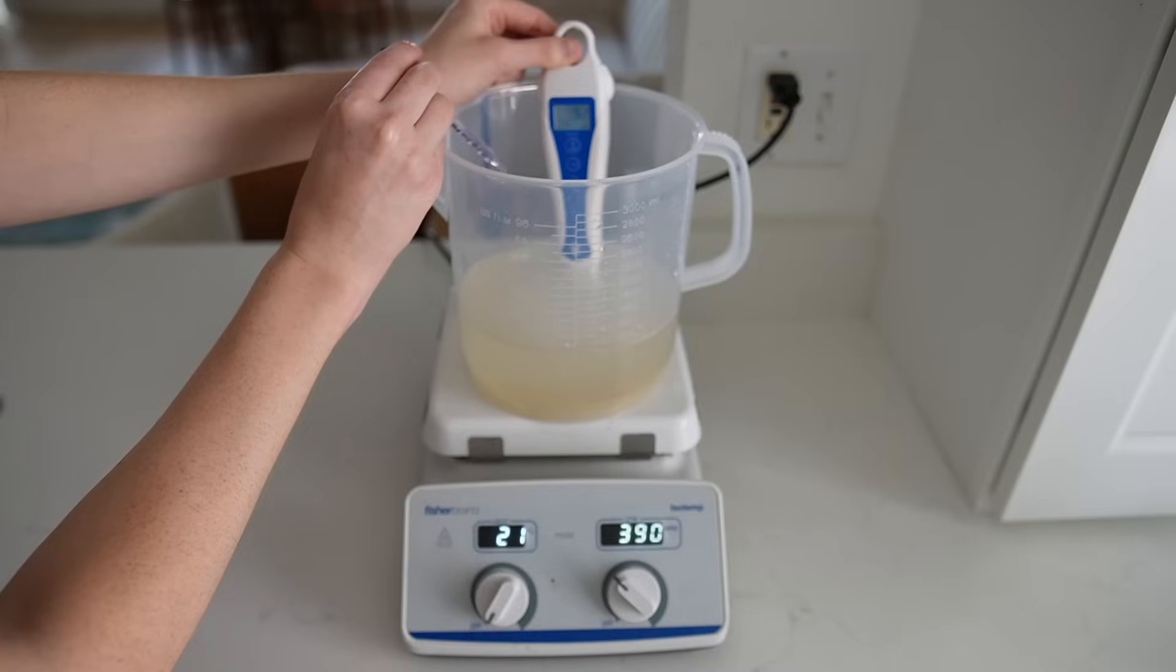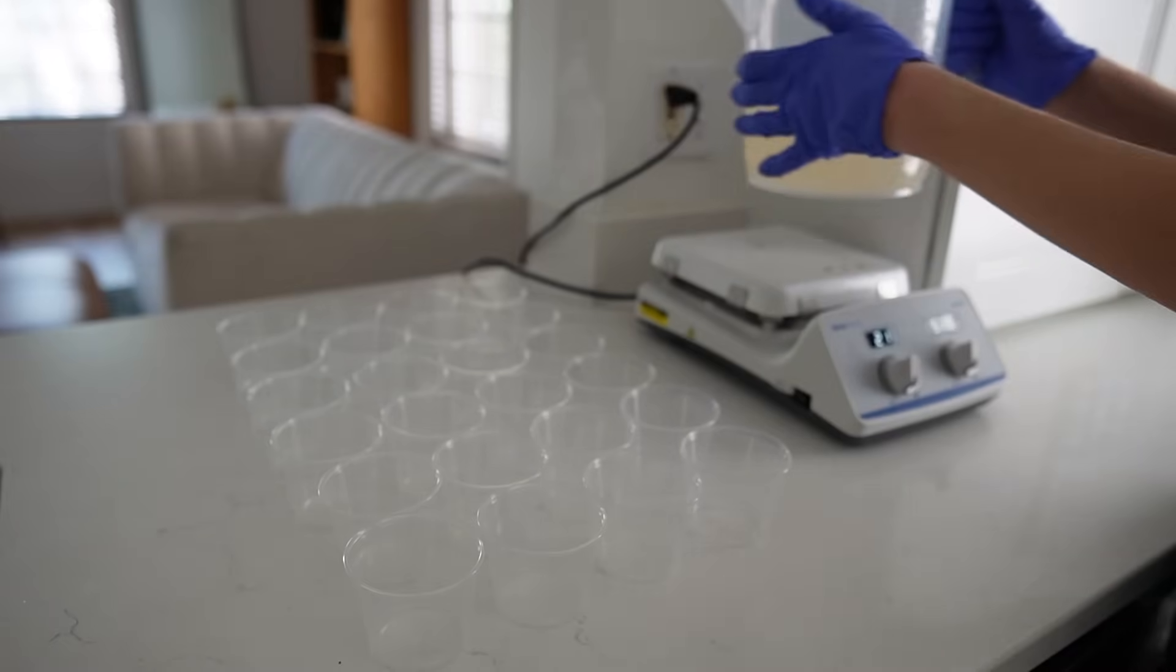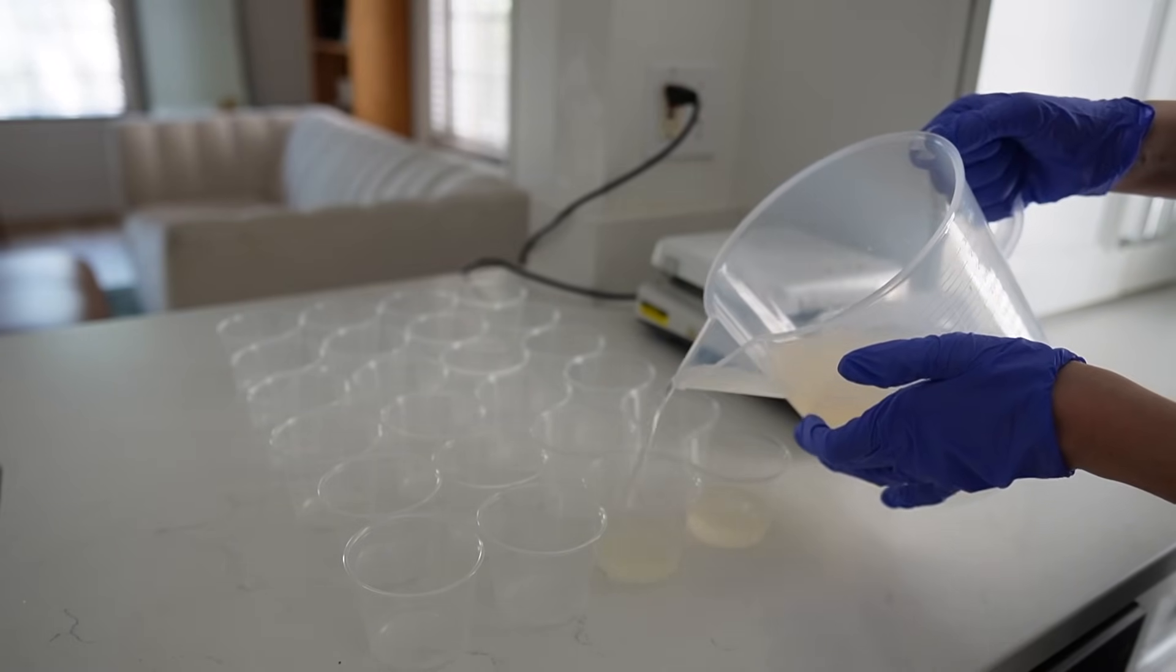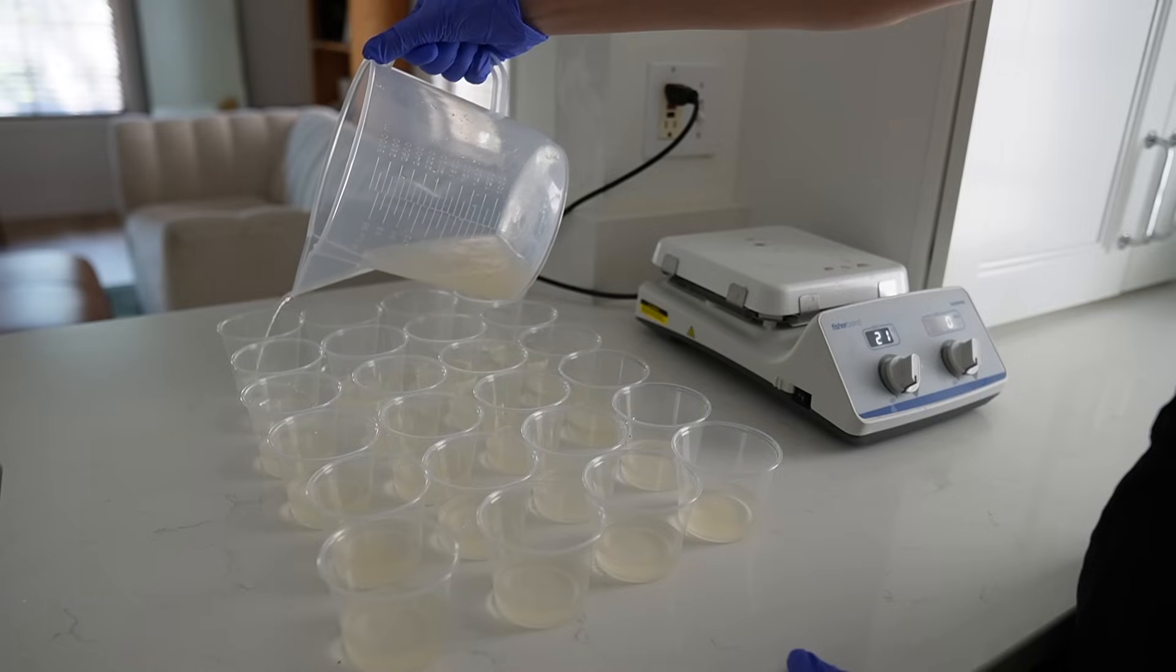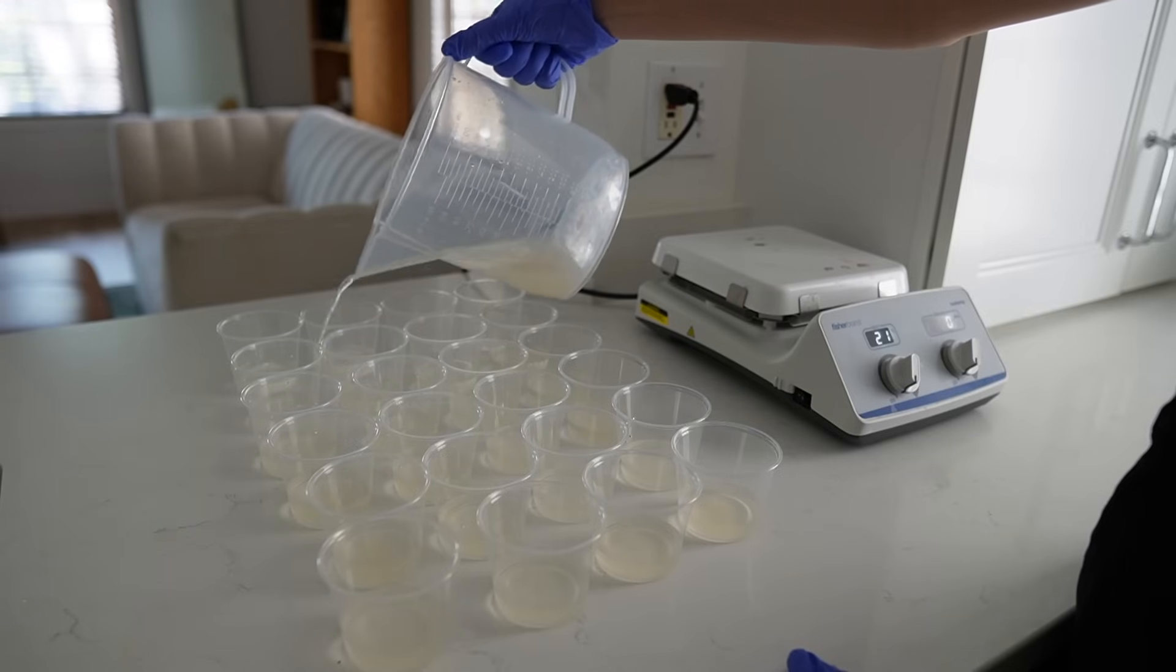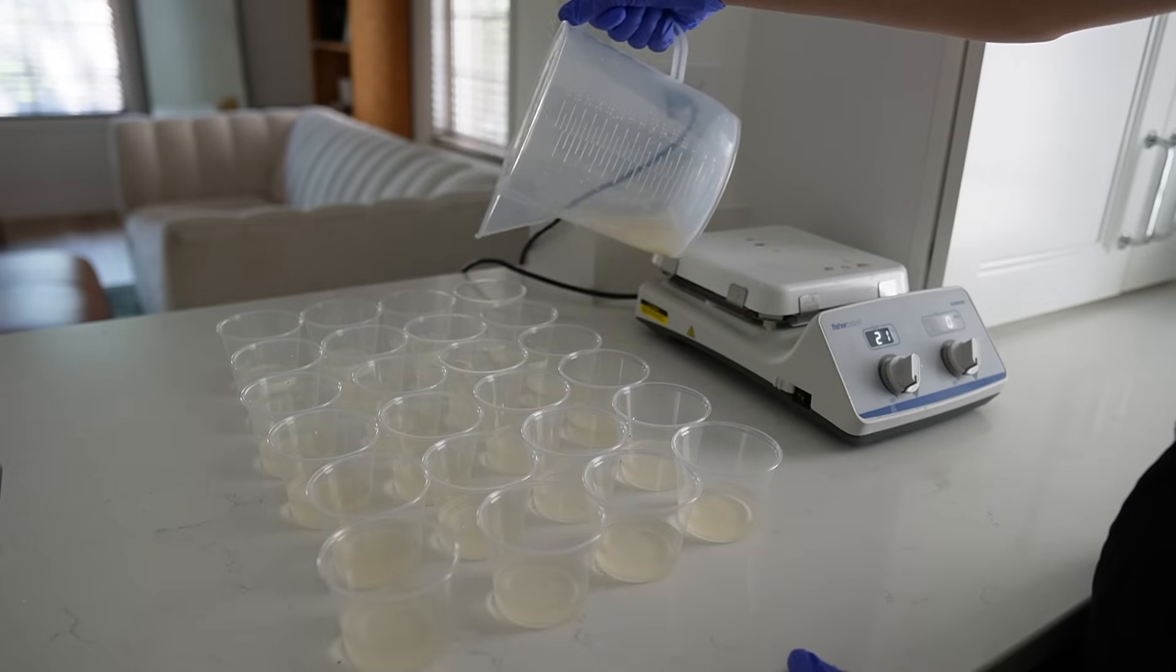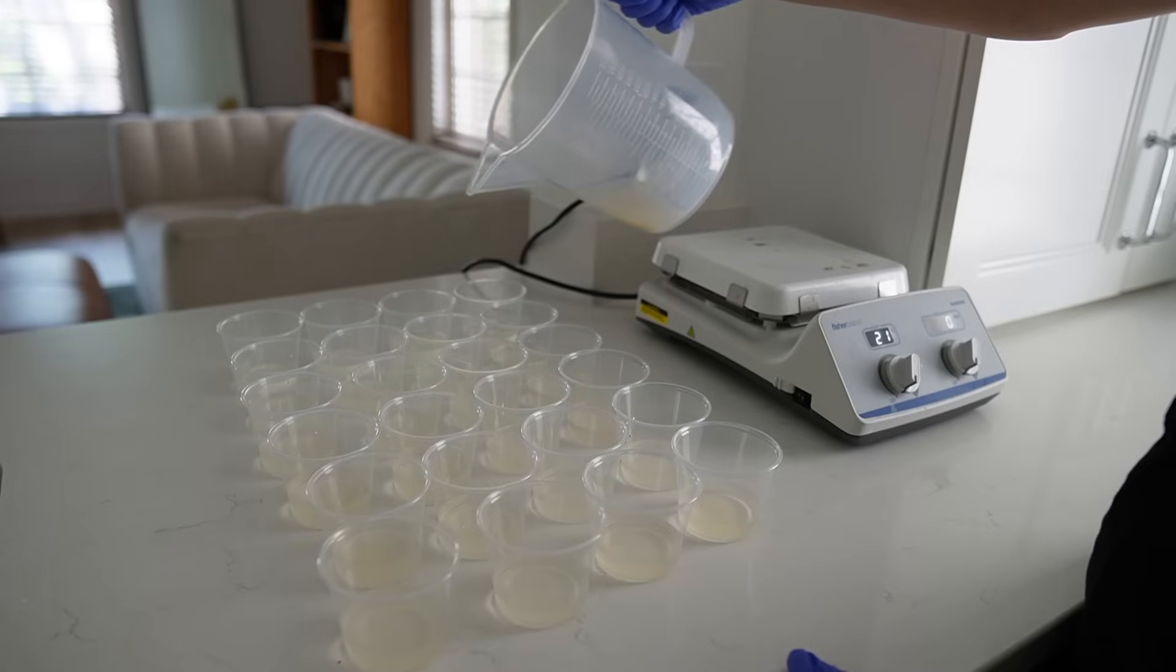With a calibrated pH probe, I adjust the pH to 5.7 using some hydroponic up solution. And after that, the media gets poured individually into polypropylene containers. I'm going to be sterilizing these in a pressure cooker. In past videos, I've recommended a microwave, but it's just not nearly as effective at sterilization when compared to the pressure cooker.